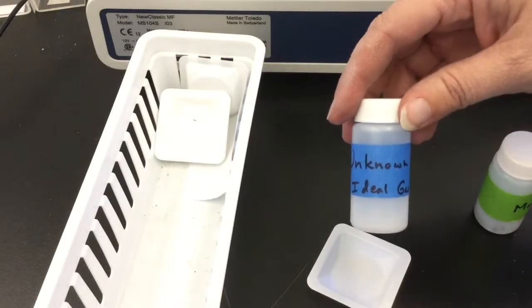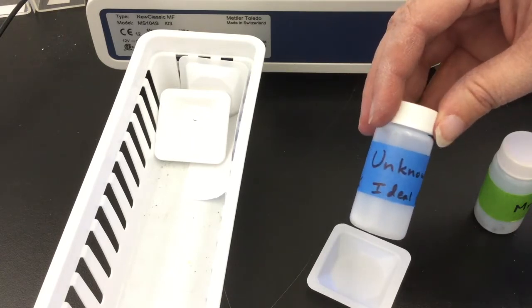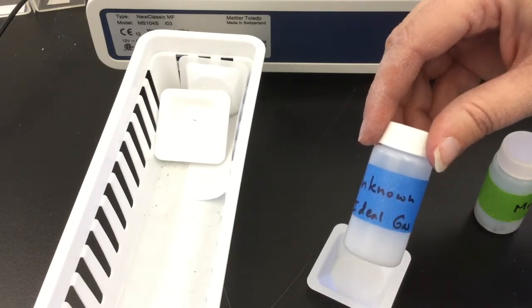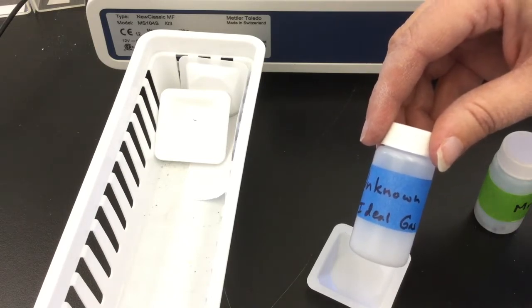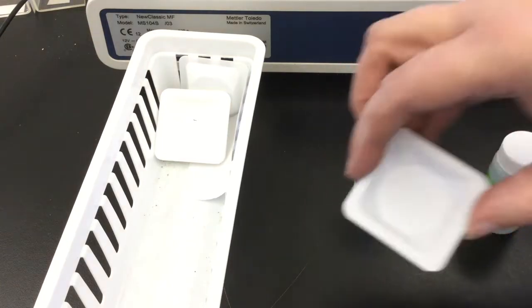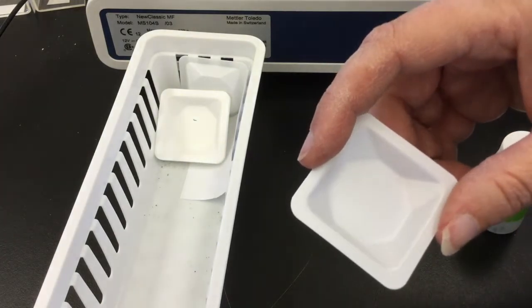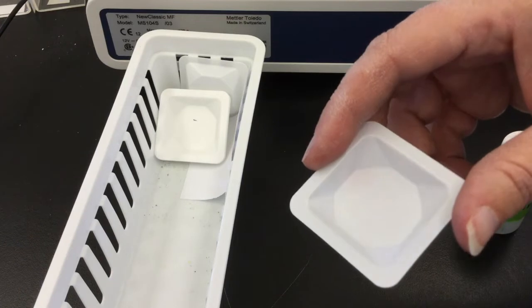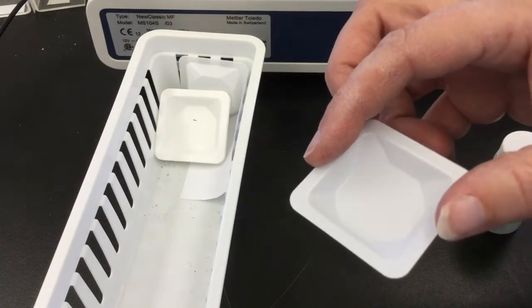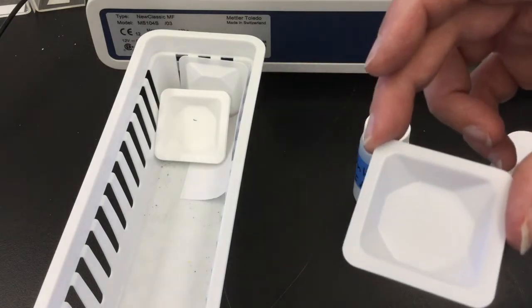You will need to weigh out the mixture of potassium chlorate and potassium chloride. The percentage of the mixture is unknown to you, and that is what you're going to be determining here today. You are going to weigh this out into a weigh boat. Check to make sure that it is a clean weigh boat. Some people aren't very good about getting rid of their weigh paper or weigh boats when they are done using them, and sometimes you will find dirty materials near the balance.